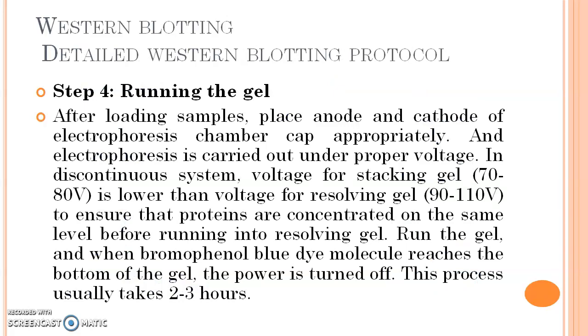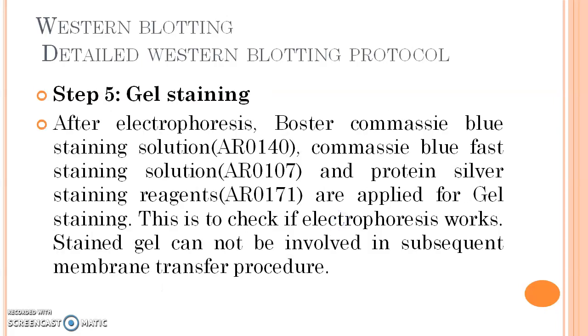Step 4 is running the gel. After loading samples, place the anode and cathode of the electrophoresis chamber cap appropriately, and electrophoresis is carried out under proper voltage. In a discontinuous system, the voltage for stacking gel, 70 to 80 volt, is lower than the voltage for resolving gel, 90 to 110 volt, to ensure that proteins are concentrated on the same level before running into the resolving gel. Run the gel, and when the bromophenol blue dye reaches the bottom of the gel, the power is turned off. This process usually takes 2 to 3 hours.